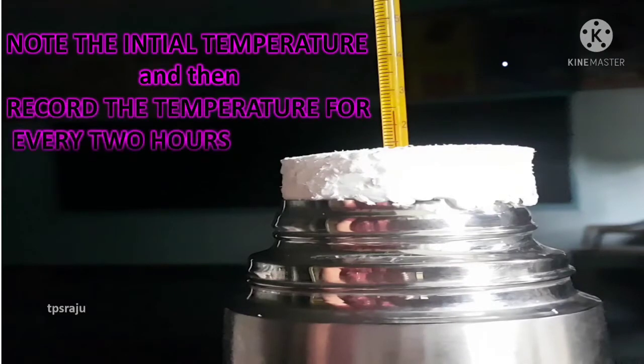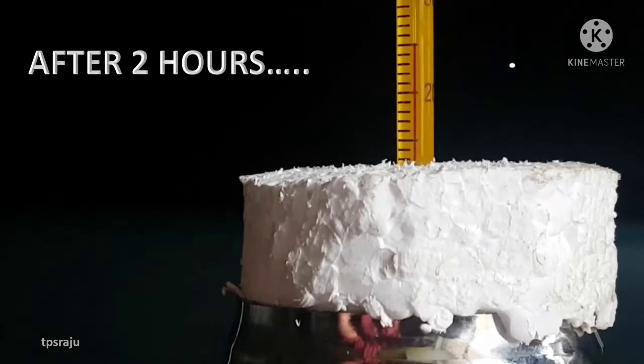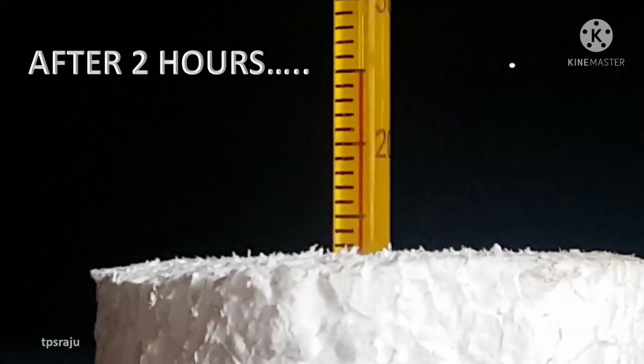Note the initial temperature and then record the temperature for every 2 hours. The initial temperature is 24 degrees centigrade. After 2 hours, the temperature is 25 degrees centigrade.